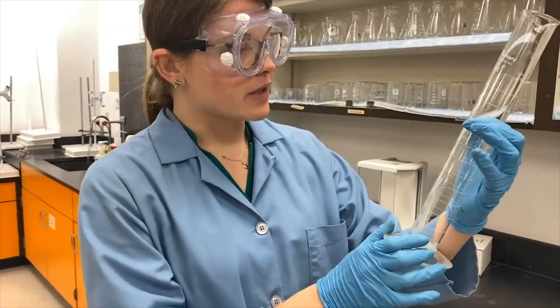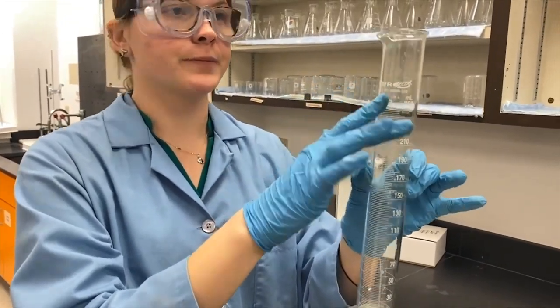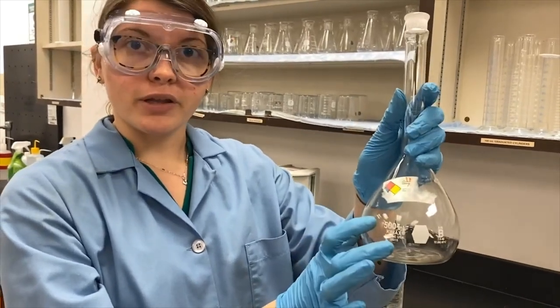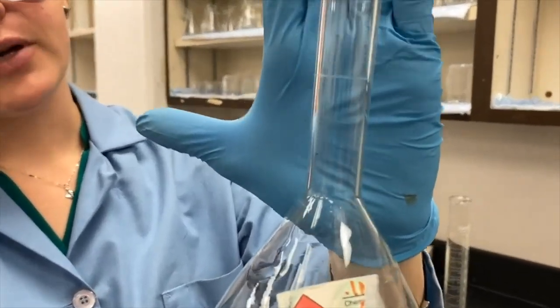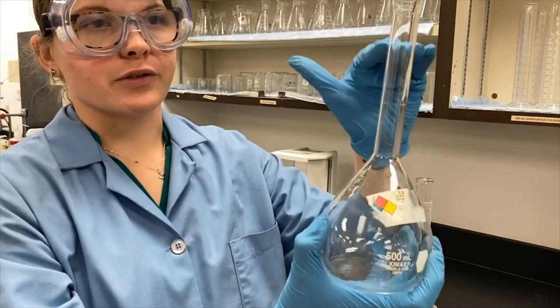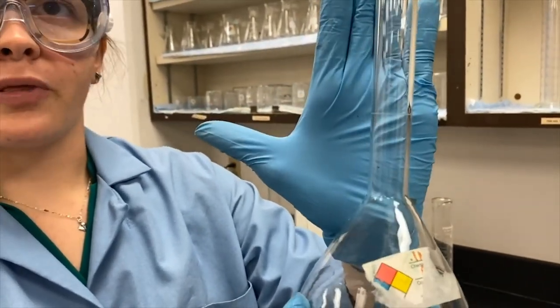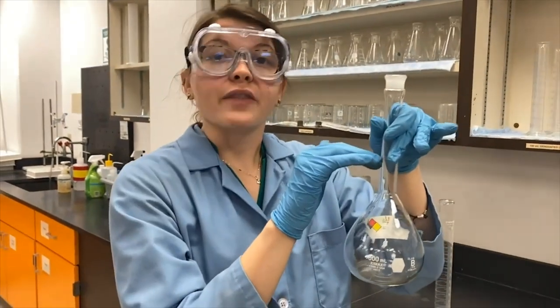This graduated cylinder has graduations every two milliliters and can go up to 250 milliliters. We won't use these much, but this is a volumetric flask — you don't see any graduations on it. It's a 500 milliliter volumetric flask and it only has one line. You are only to make 500 milliliter solutions in this — you can't do 400 or 600, only 500. You make sure this line is solid when you're looking at it, and you have to make sure both lines line up. We'll talk about the meniscus later, but that's where you want to line the meniscus up.